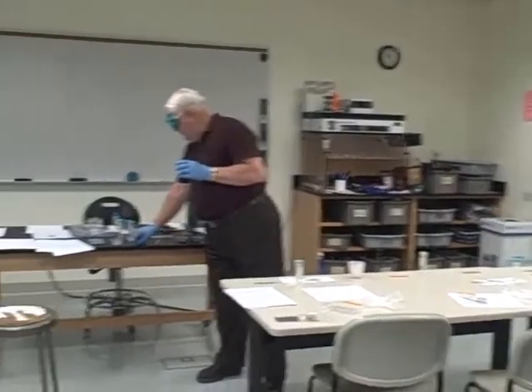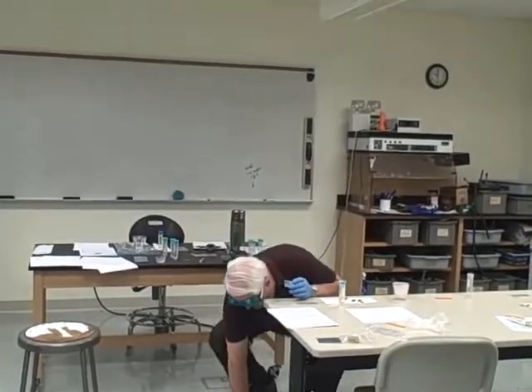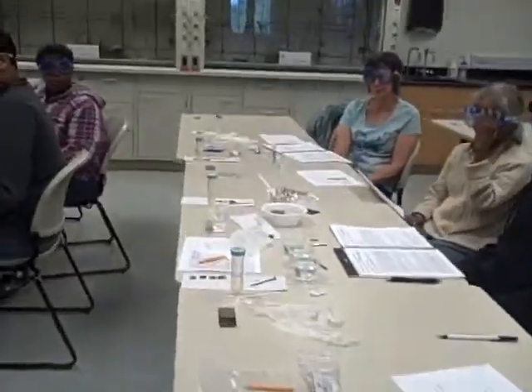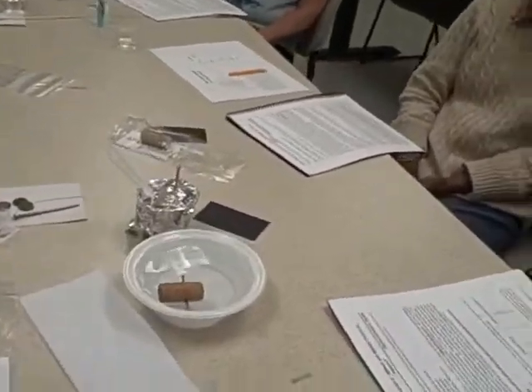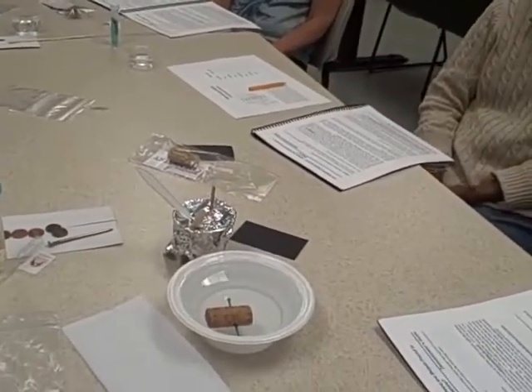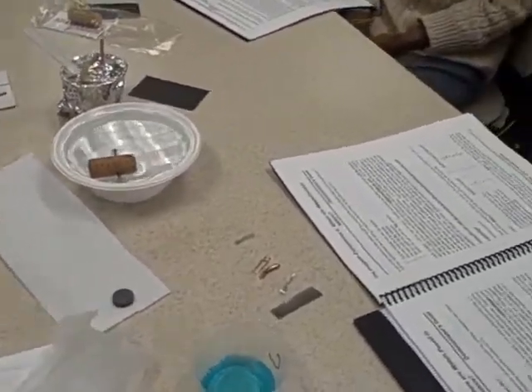We now have the same six samples that each of you have at your tables. And as a demonstrator, if I don't drop the silly things, I'm going to start dropping these in a cup of water that I have at my table to see if any of the other 5 metals that we have, again, they're the same things that you had on your table.